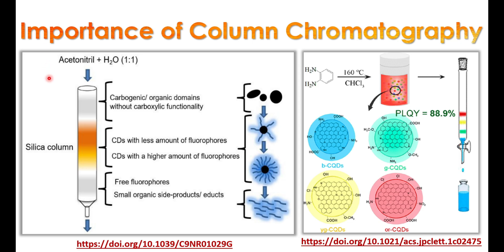Please see the picture. Suppose you have different types of carbon dots with a mixture of fluorescent intensities — you can use a column to separate out the fraction with maximum intensity. Also, if you have quantum dots with different colors of fluorescent emission, you can also use a column. As larger nanoparticles have a more red-shifted fluorescence emission, the blue emission fraction is collected first and the red emission fraction is collected last.